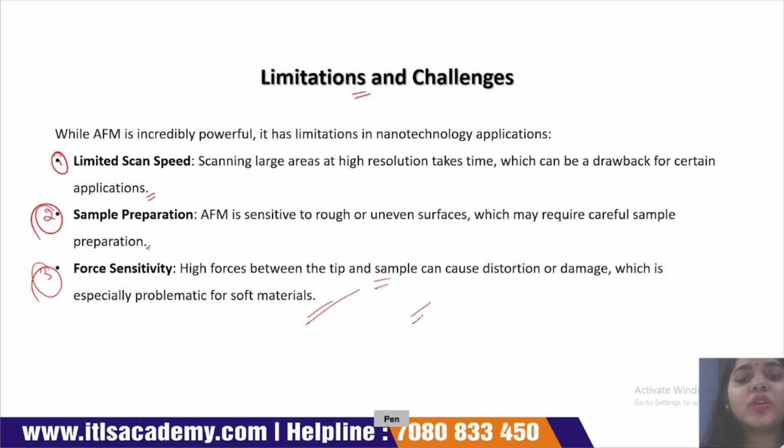This is all about today's lecture. In this video lecture, we discussed what AFM is, the working of AFM, the application of AFM in nanobiotechnology, and its limitations and challenges.